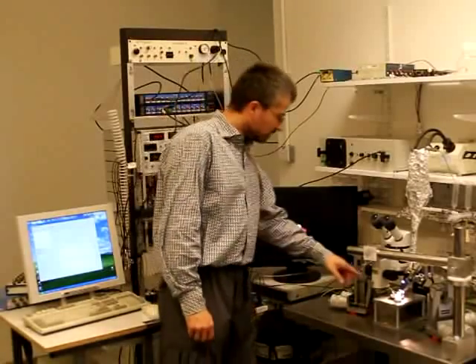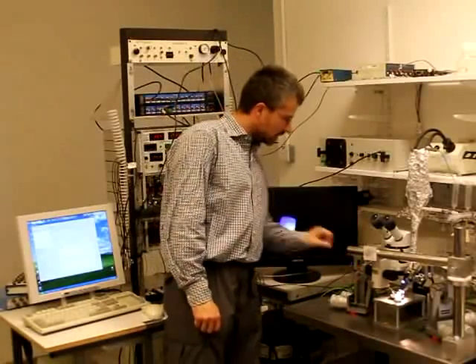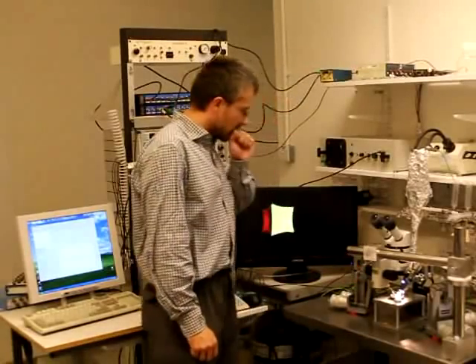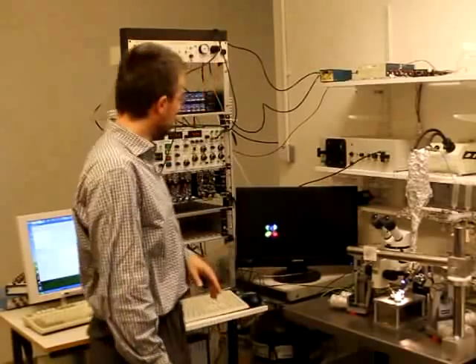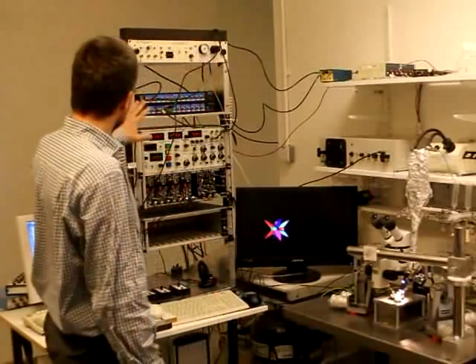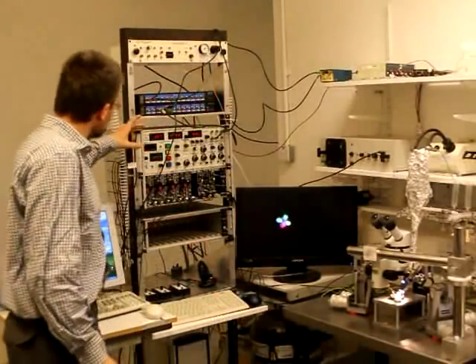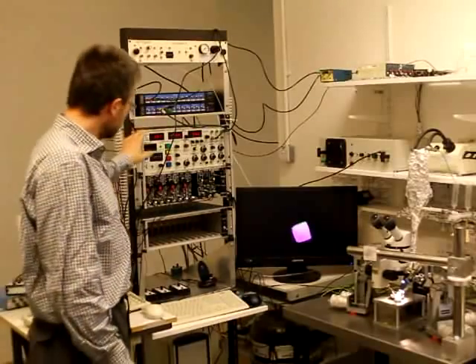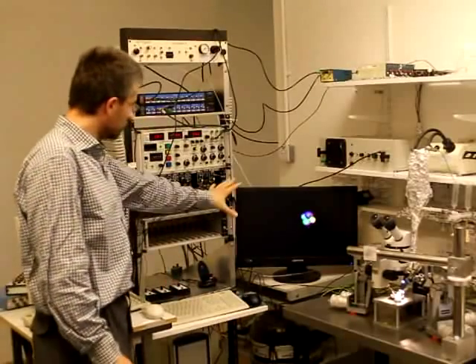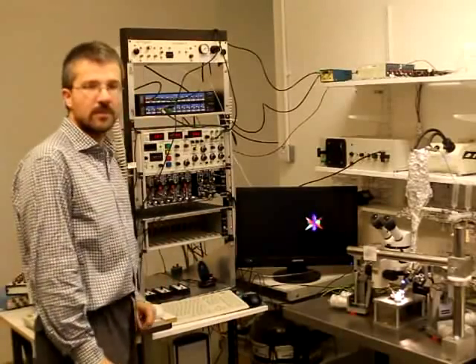The biological preparation goes here. And then this is connected to a main amplifier, which is here the AXOCLAMP 2B in our case. And that goes to the recording computer over here.